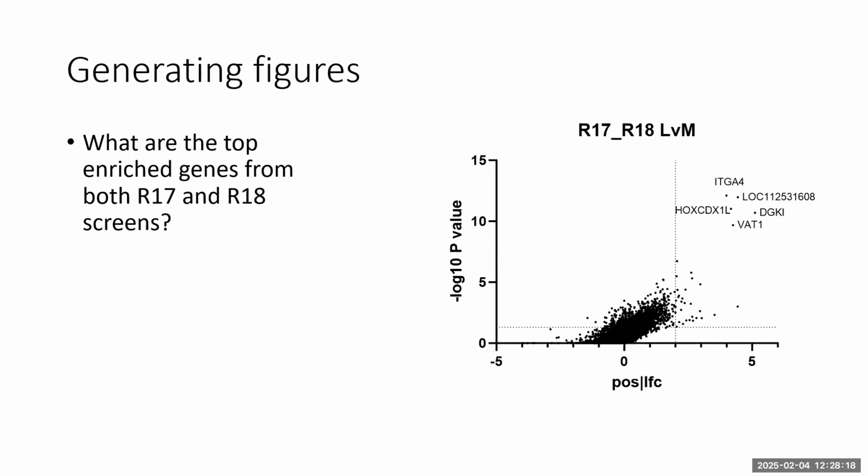If you get a really good screen at high power, what you tend to see is all these start lining up and plateauing, because you can only get a certain level of p-value, and it plateaus. If you get 30 or 50 genes all like that, then you know you've got a really good screen. These ones may be involved in things, but the confidence is a lot lower. Obviously, the more repeat screens you do, the better the power you get, and the more confidence you're going to have in the hits.